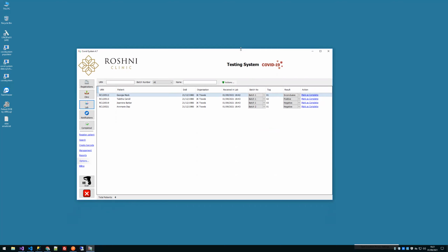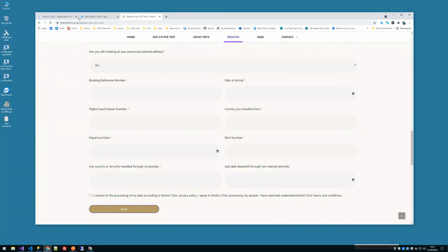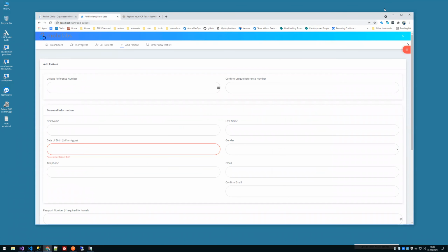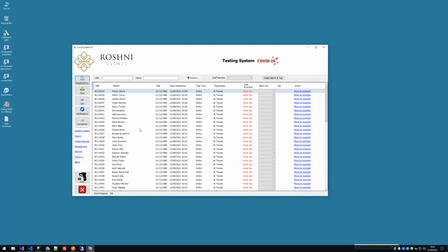This is what I was talking to the team about. Basically, I want to give you a copy of this. Obviously, the website is going to be available through a test URL or whatever. But this system I wanted to, and what I've been through there with all these dummy patients. These are all dummy patients, by the way. I won't be showing real patients. So these patients, you can have a play around with or send patients in, give your own RC number or DOC or whatever, that kind of stuff. I wanted to open it up a little bit like a little playground area. But I've not got around to that.